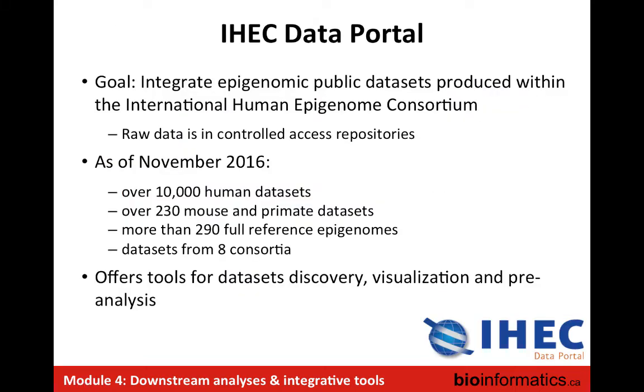So that brings me to the IHEC data portal. The goal of the portal is to make available and discoverable the public data sets produced by the different IHEC members. So again, raw data is in controlled access repositories, but the public data that you can visualize and start analyzing right away is available on the IHEC data portal.